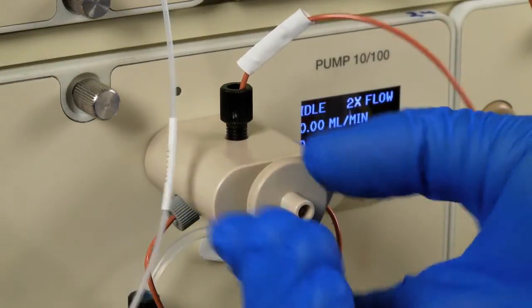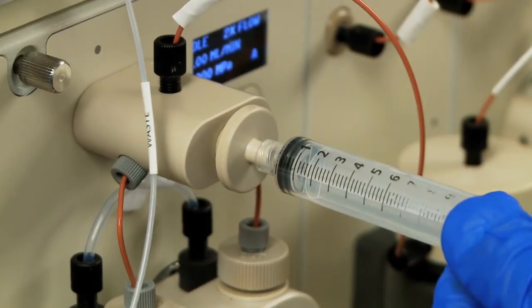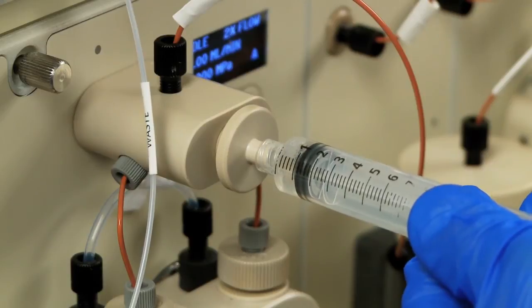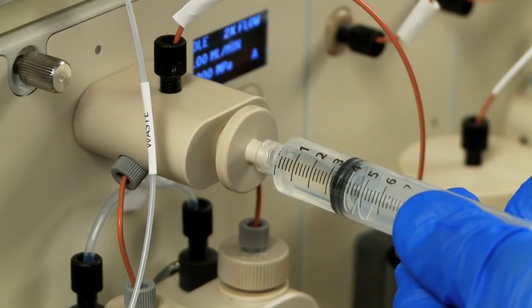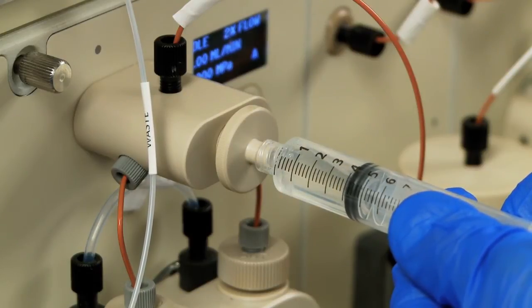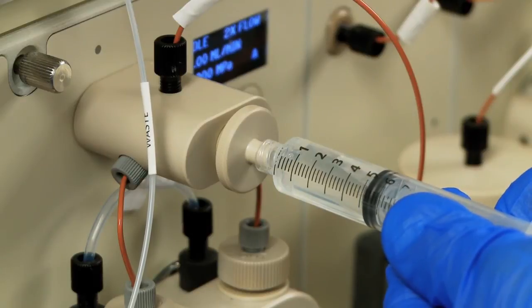Open the priming port by turning it counterclockwise. Then attach a syringe into the port. Pull back on the plunger until a steady stream of liquid is observed and no more bubbles appear. You should withdraw approximately 10 milliliters of liquid. You may want to do this a second time to ensure the lines are completely filled with buffer.